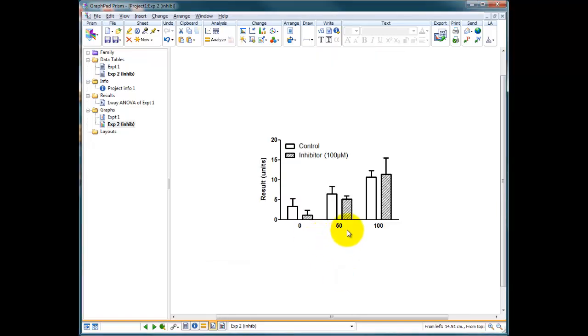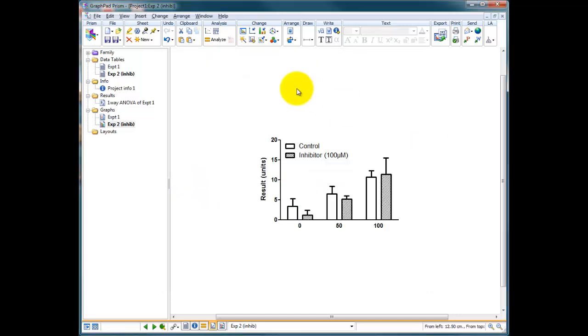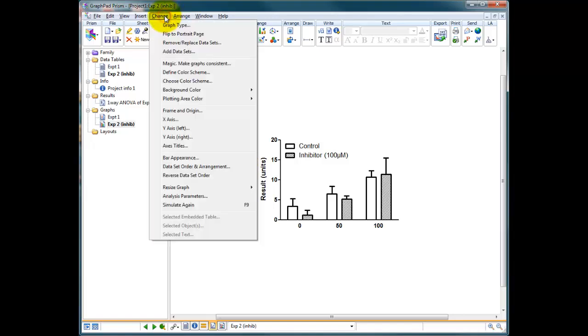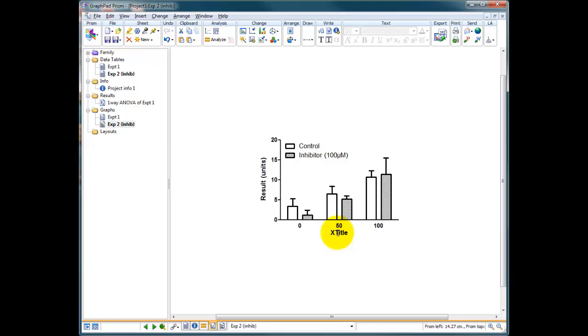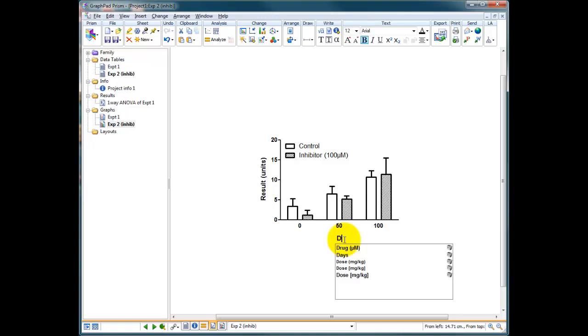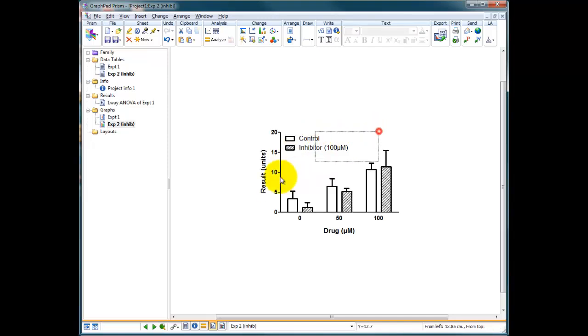So if I go in here I should be able to add a label. So to show the x-axis label we go to change axis titles and you've got show axis title for x. Put that back again. Now it says x title. So I can move him down. Double click on him. And this can be our drug in micromolars. So there we are. Drug in micromoles across the bottom. Result. Units up the left. And we've got control and inhibitor.